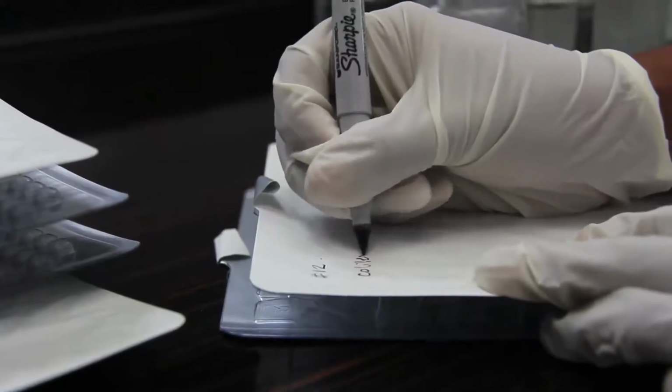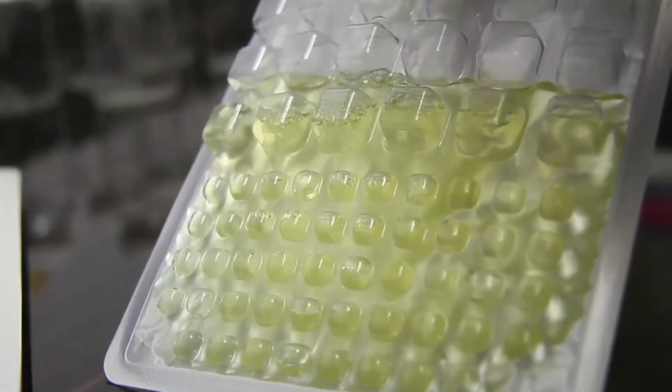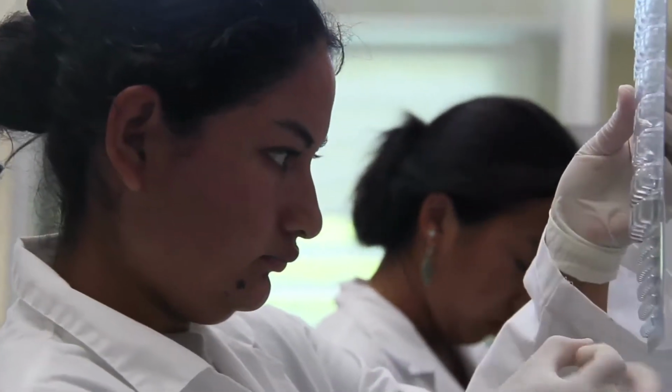Right now, I'm just labeling the Quanti-Trays for when we put the sample in them, seal them in the Quanti-Tray sealer, and then put them in the incubator.